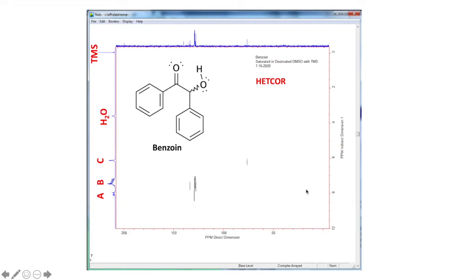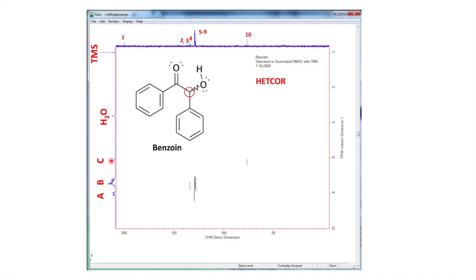Remember, it's kind of confusing — the hydrogen scale is way over here. TMS is around zero and these aromatics are around seven to eight. For the carbon axis up above, you've got your numbers down here, so the carbonyl signal is around 200. Let's label them one through ten. We can notice this signal — we know its proton signal should be around this area and its carbon should be around here. That signal in the HETCOR tells us that hydrogen C — specifically the methane one, not the alcohol one — is connected to carbon signal 10.